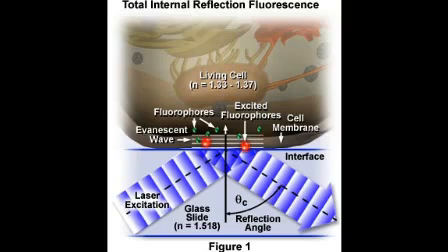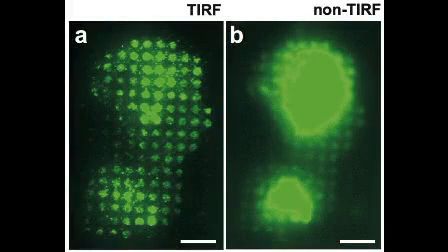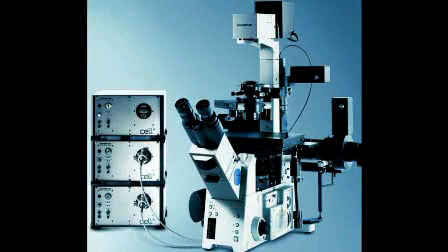The only requirement for the readout is a fluorescence microscope capable of illuminating the sample in total internal reflection configuration. Such systems are commercially available from different suppliers and became easy to handle for the user over the last years. Our detection system is set up on an epifluorescence microscope. Argon and krypton ion lasers are used for selective fluorescence excitation of the used fluorophores. Samples are illuminated in an objective-based total internal reflection configuration using a 100-fold magnification high NA oil immersion objective.